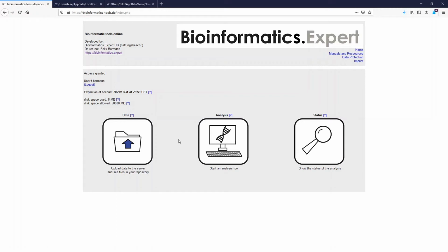Welcome to Bioinformatics.Expert. This is an additional video for the amplicon sequencing analysis pipeline. In the last video, which I did several months before, I showed you how you can use the Bioinformatic Tools online program to analyze amplicon sequencing datasets.